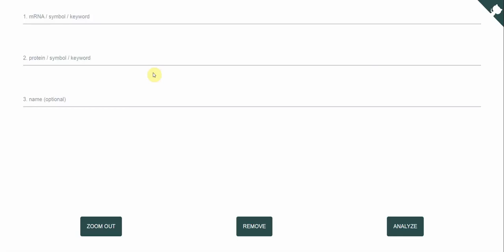Especially if you're not really knowing much about the genetics and how these things are annotated, the nomenclature and so on. So I tried to make this whole process a bit more streamlined. This is my take on finding open reading frames and I will just briefly walk you through how to use the software.